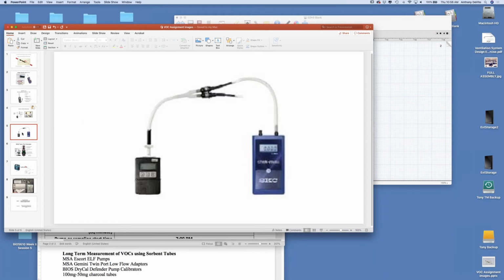In this particular case, you'll notice that we have a single pump. There's a little pressure controller. We have a single pump, but we have two tubes connected to it. This is part of the calibration process. Notice we're connected to the tube, and we have the pump on. We're adjusting the volume that's flowing through the tube. We have two of them set up. Each has its own separate needle valve.